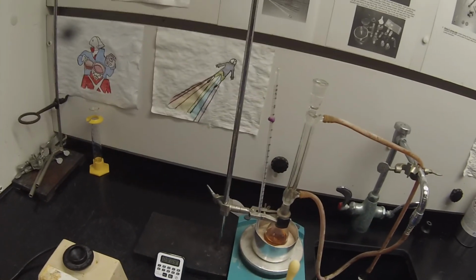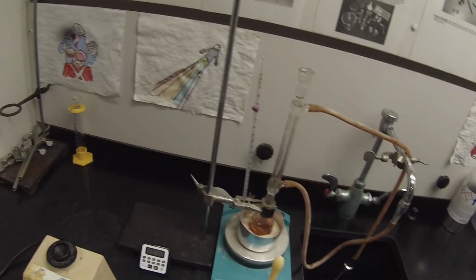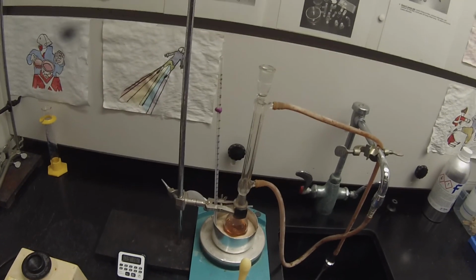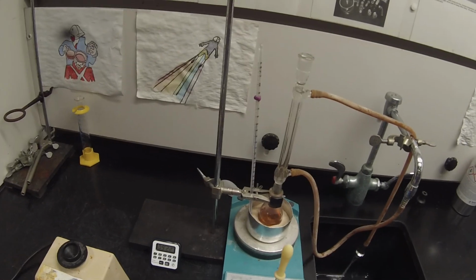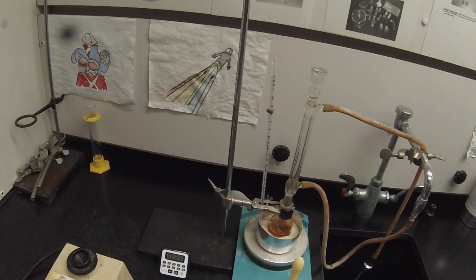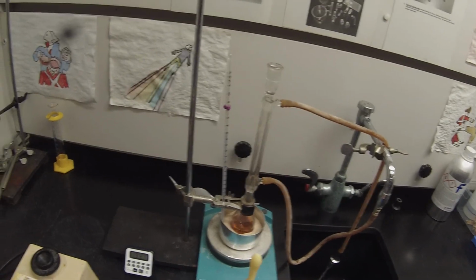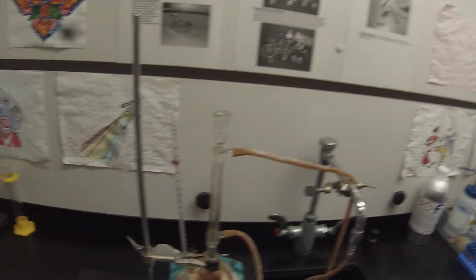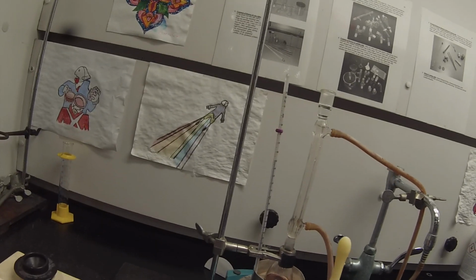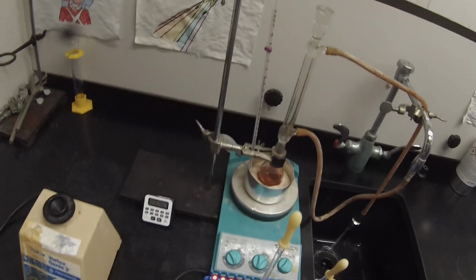We're going to be plotting a graph after we get the GC mass spec data, where you plot the concentration or the percentage of the alcohols, 2 different alcohol products that you'll be able to see, and then the percentage of each of the alkene products as they appear. And we'll be able to tell which one's which because the molecular weights are 190 for the alcohols and 172 for the alkenes. So we should see 2 new molecular ion peaks with a molecular ion at 172. Probably as early as the 1 minute data point, we'll be able to see some of that.